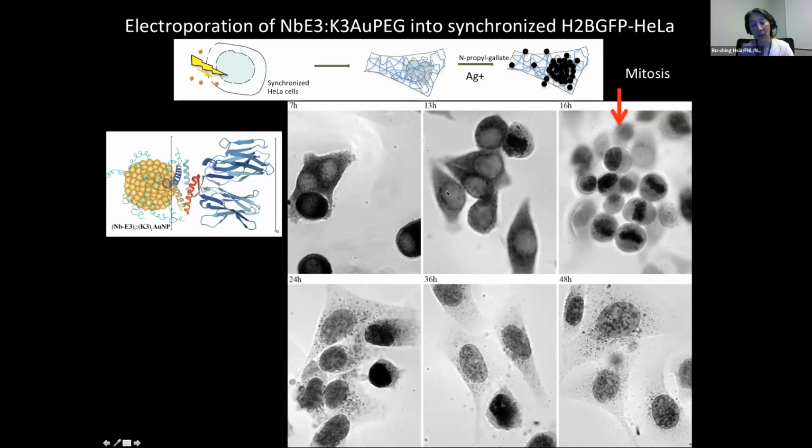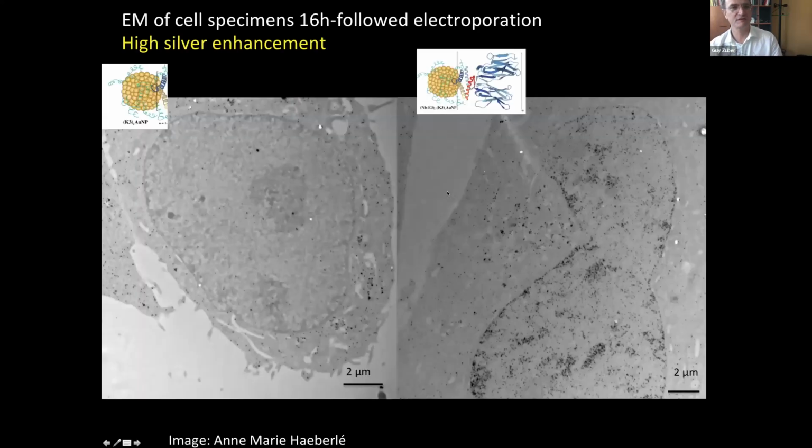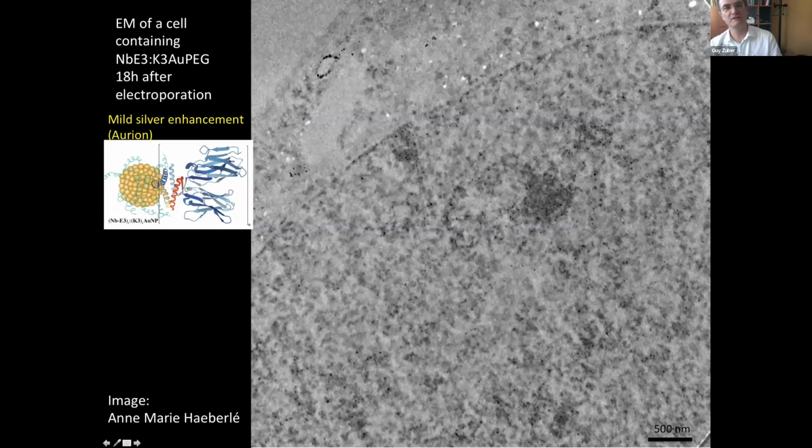Do they end up in lysosomes if you wait? They do. Yes, we have some accumulations in lysosomes as well. But for CLEM or for cryo-electron microscopy, it's not so bad, because if they go into lysosomes, they concentrate. So here you can see the particles getting concentrated, so you can pinpoint them much more easily. So it's also helpful.